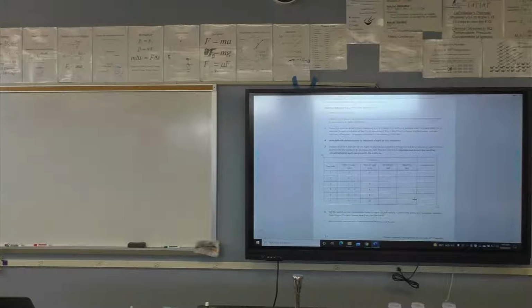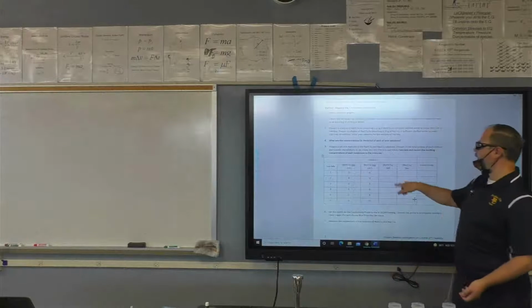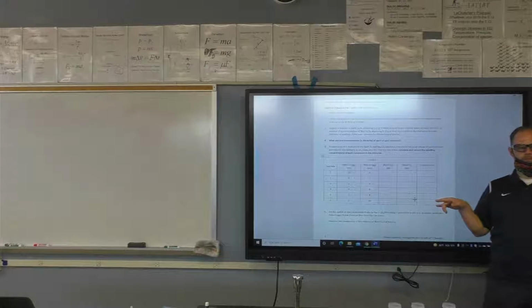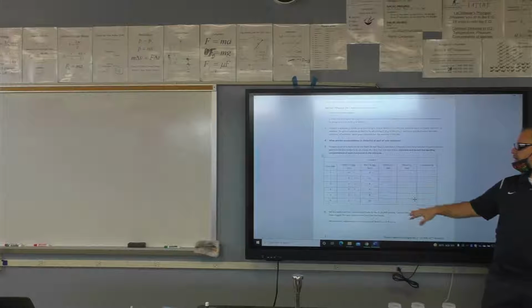Okay, questions? All right, so once we have completed that, and somebody left a nice little pen. That might be mine. Anyway, so once we have completed doing the conductivity, once you've got your conductivity graph, you're going to post your graph under here, see if you can figure out what the molarities are. Okay. So yeah, see how much of that you can do. If you get stuck, that's okay, we'll come back to it and talk about it hopefully at the end of class.